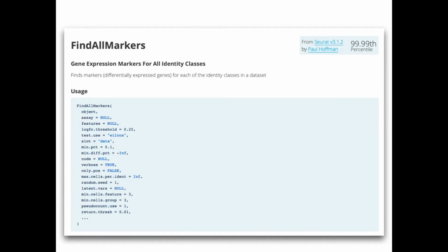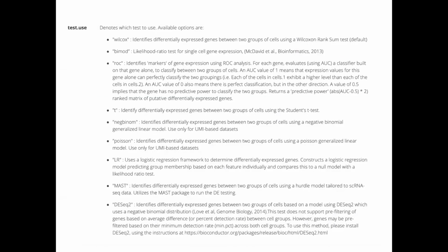I'm not sure if any of the Seurat methods actually changes. I know there are some that say it should be counts, but I don't think any of those are in Seurat. By default it will be the data normalized one. Only the DESeq, negative binomial, and Poisson, and maybe MAST will use the counts. The rest you should do on the log transforms. Yeah. Okay.